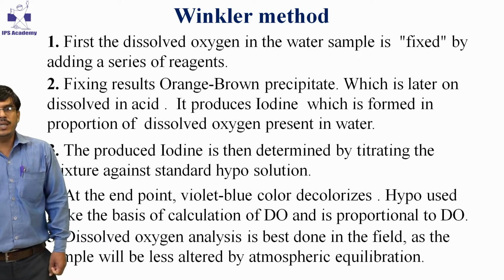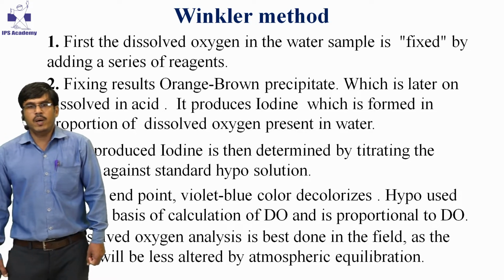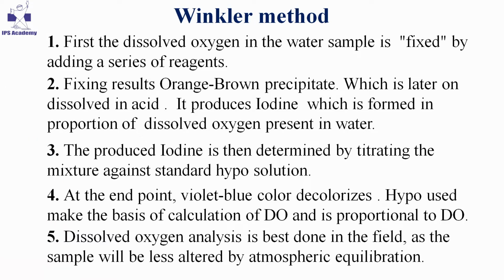When it completely decolorizes, it is an indication of the end point, and the amount of hypo used for decolorization of the blue color will determine the quantity of dissolved oxygen. Dissolved oxygen analysis is best done in the field, as the sample will be less altered by atmospheric equilibrium.